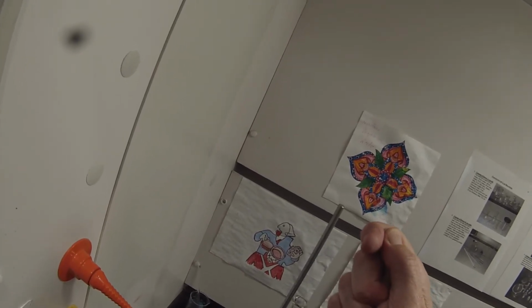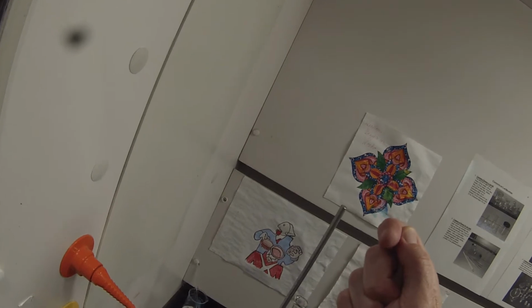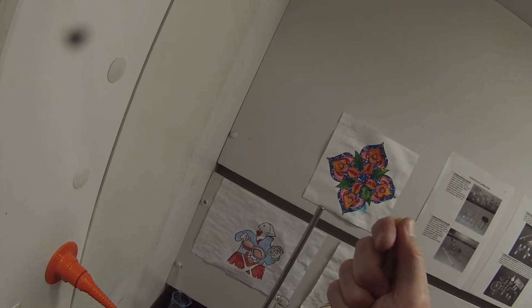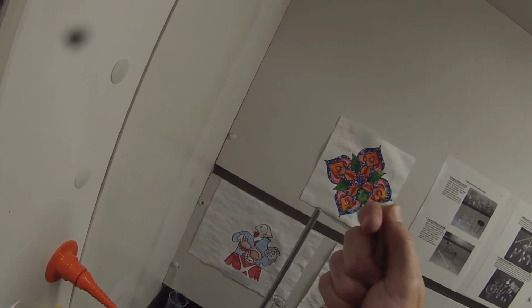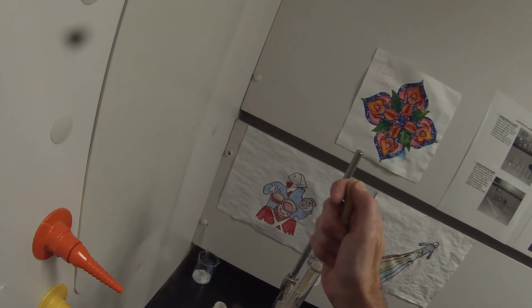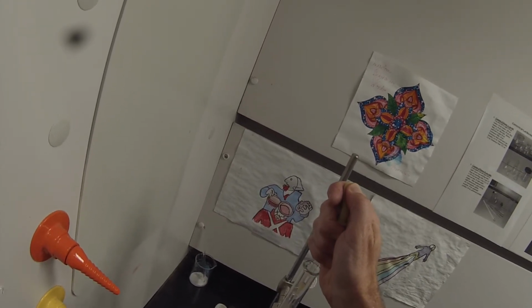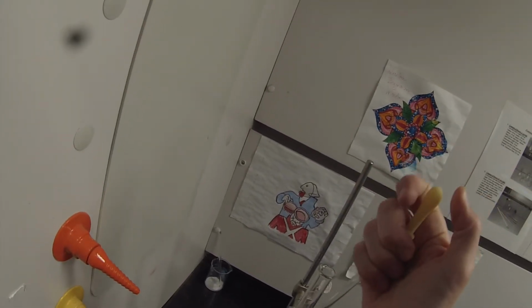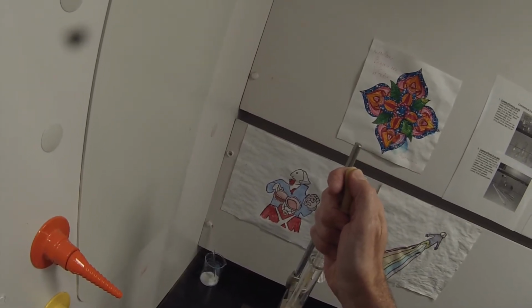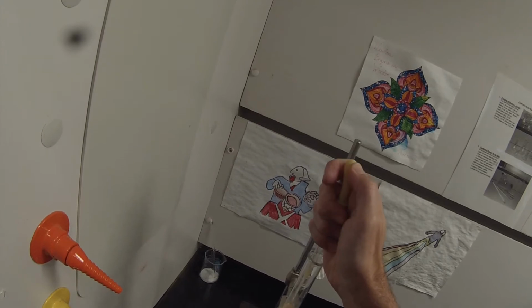So what I'm trying to do is mix that so that I get a pipettable liquid that won't clog the pipette. It looks like it's going to be a bit of a challenge. And then I want to add that before the column goes dry. So it may be necessary for me to stick my finger over the top of that. And it just doesn't want to dissolve in that eluent. Classic problem. Very hard to solve.